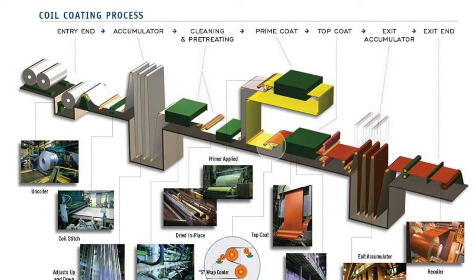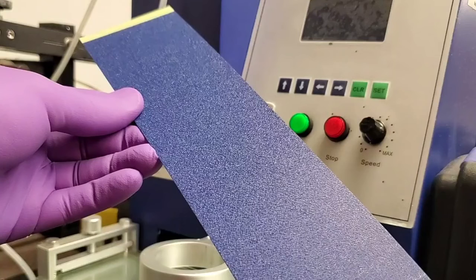This resistance to solvent is an indication of the degree of cross-linking. An insufficient level of cure is characterized by not enough double rubs. An overbake condition is characterized by an excessive number of rubs. Both conditions may affect the long-term durability of the coating. Rubbing a cured coating with a cloth saturated with an appropriate solvent is one way to determine whether a proper level of cure is reached.